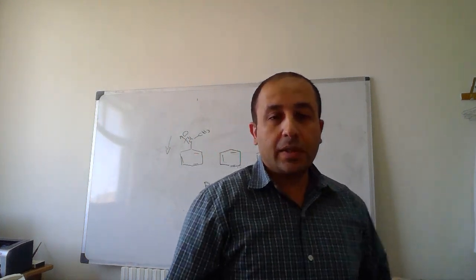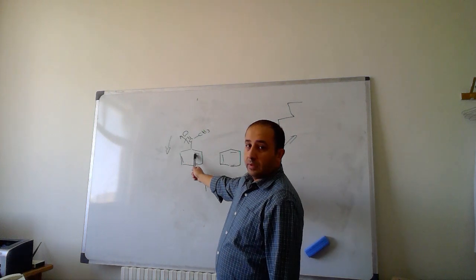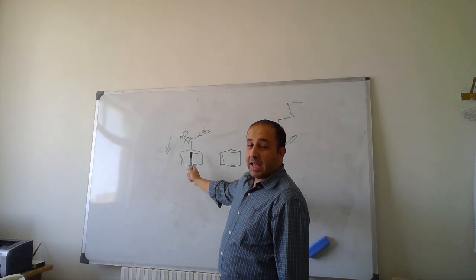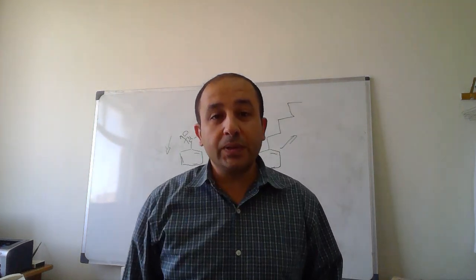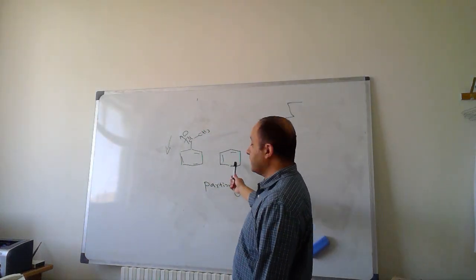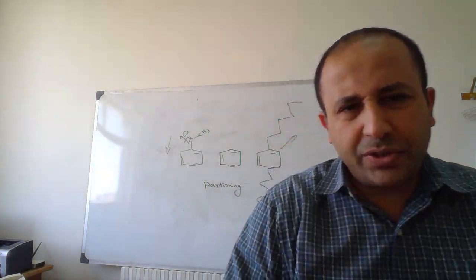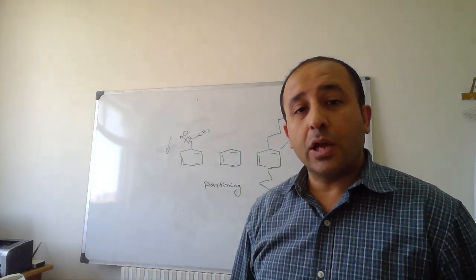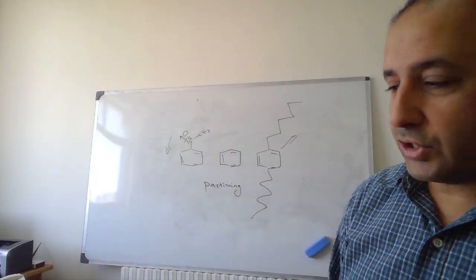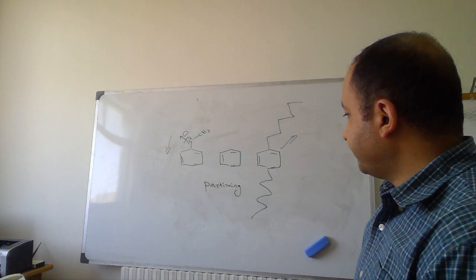So the one which has the least interaction with the stationary phase will elute first. Then benzene, and the last one will be the most hydrophobic, which is retained longer in a hydrophobic stationary phase, such as ODS or C8.